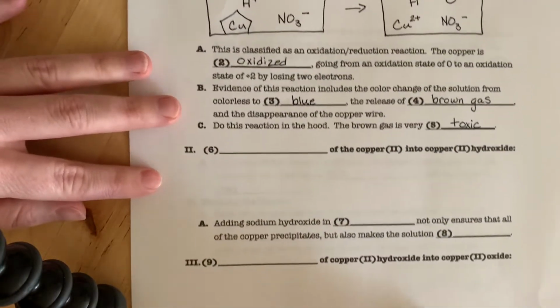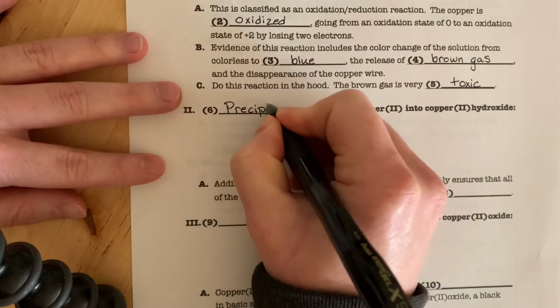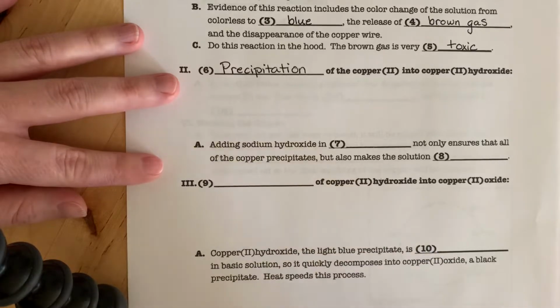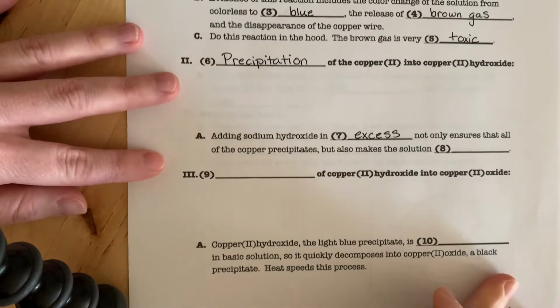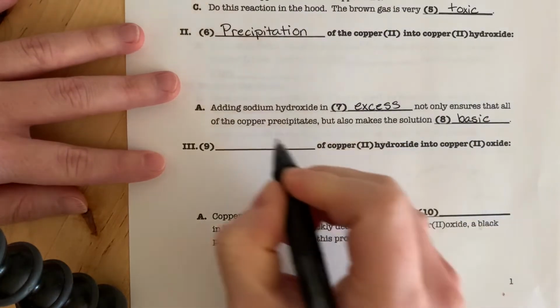Okay, next reaction is the precipitation of the copper 2+ into copper 2 hydroxide. So we are going to add sodium hydroxide, a strong base, in excess. Pretty huge excess. And that is going to make the solution basic, as you'll see in a moment.